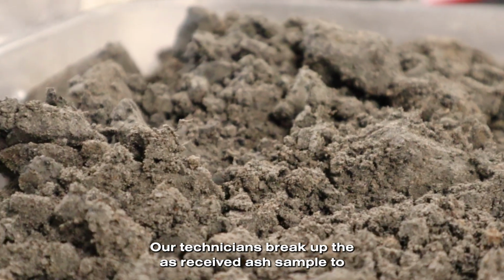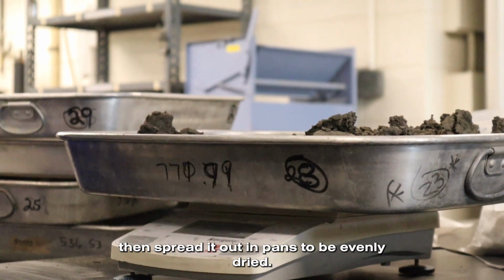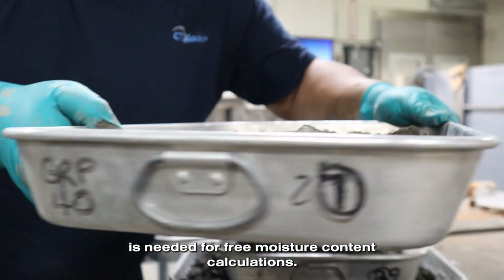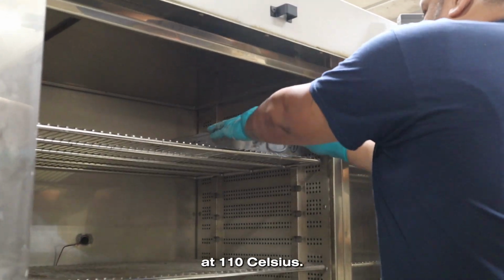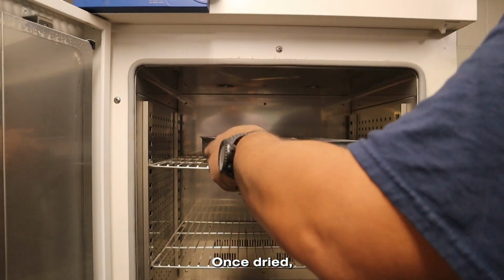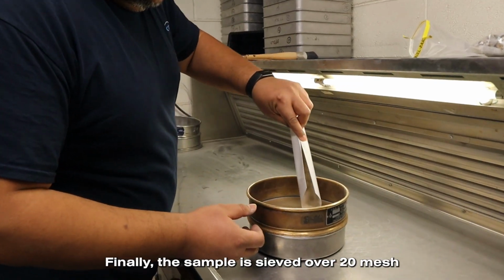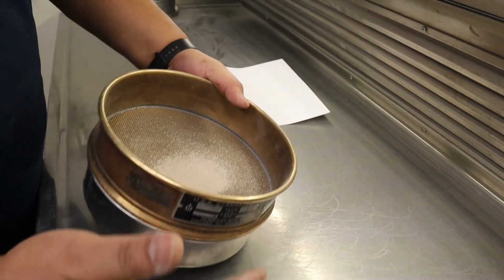Our technicians break up the as-received ash sample to then spread it out in pans to be evenly dried. Initial weighing and recording of the weight is needed for free moisture content calculations. A portion of each sample is then dried at 110 Celsius. Once dried, the sample is weighed out to finalize data collection for loss of moisture. Finally, the sample is sieved over 20 mesh and delivered to our mortar lab.